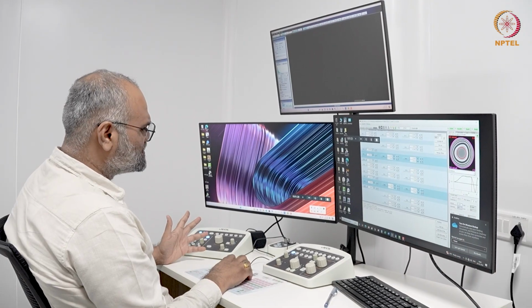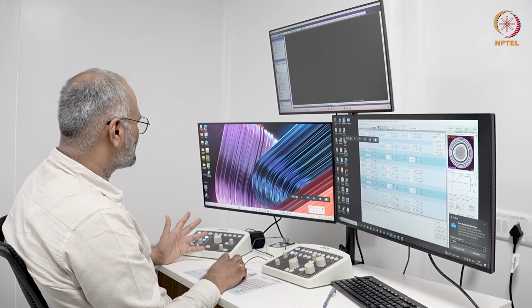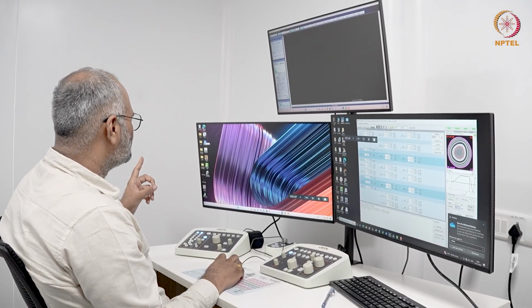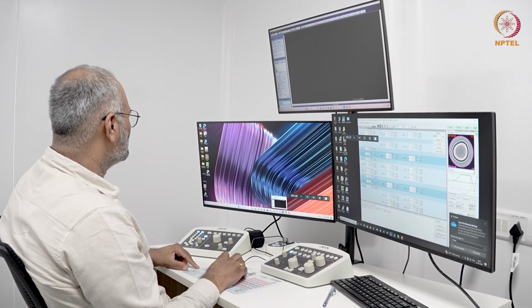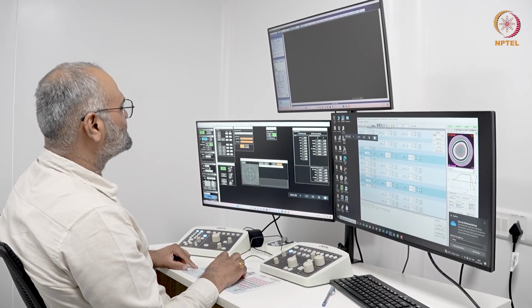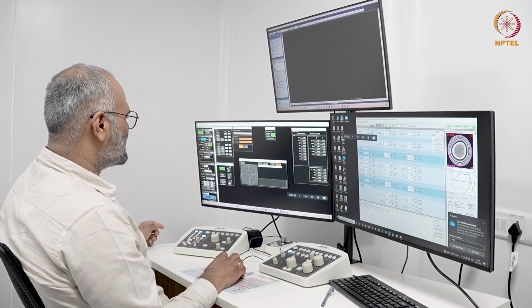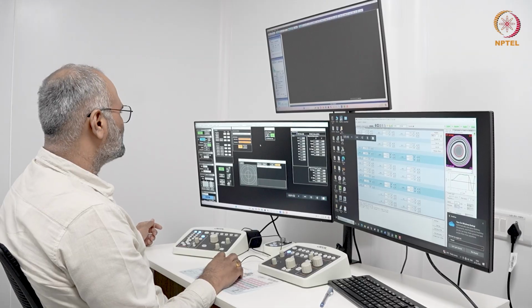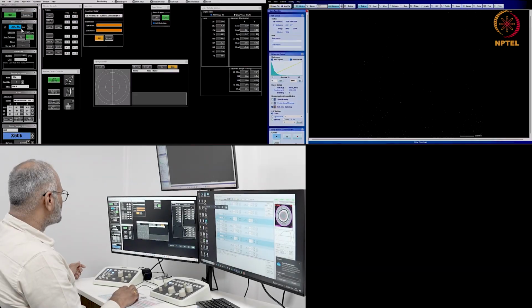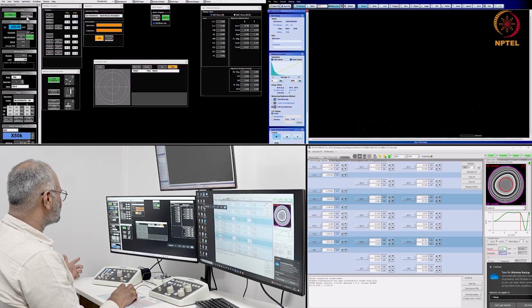The first thing that you need to check on the TEM PC again is to ensure that this TEM server is running, and the software that we use to control the microscope is the TEM Center. So this blue hexagon icon is the TEM Center, and this X icon is the Site X on which you see the fluorescent camera. If I look at the overview of the software now, there is a lot of information in this left column. On the top, you can choose whether you are operating in TEM mode or in STEM mode.